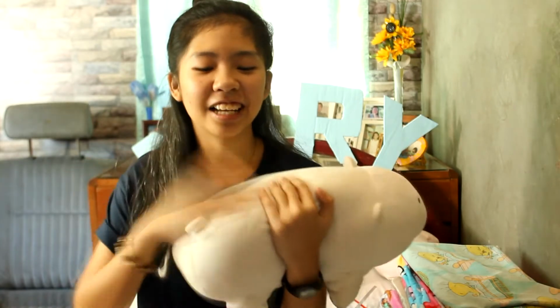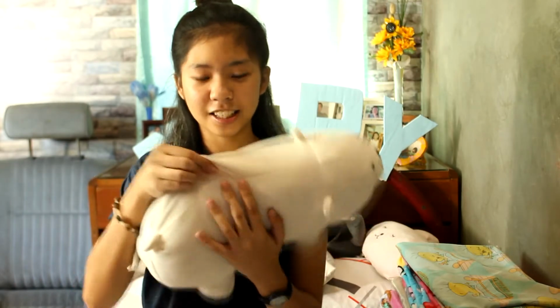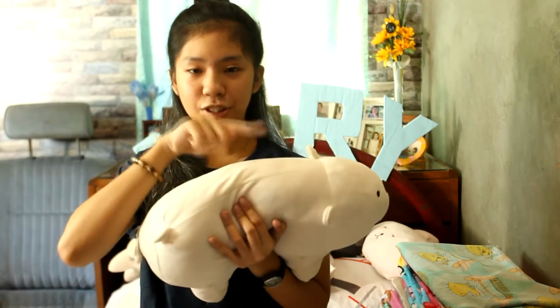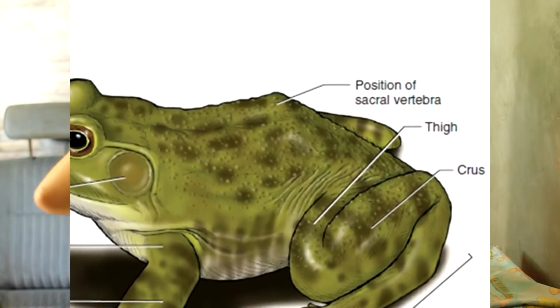Then the sacral hump, which is here. This is found in frogs, and it helps them hop. It is produced by the protrusion of the pelvic girdle. Okay, so now we're done with the axial region. Let's go to the appendicular region.